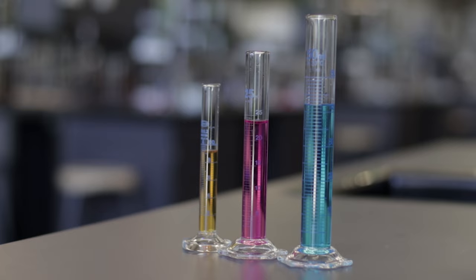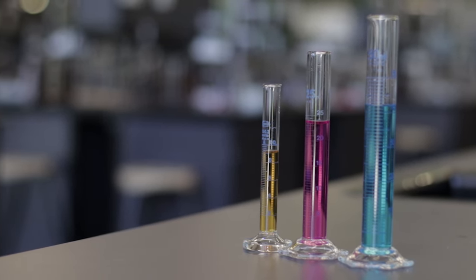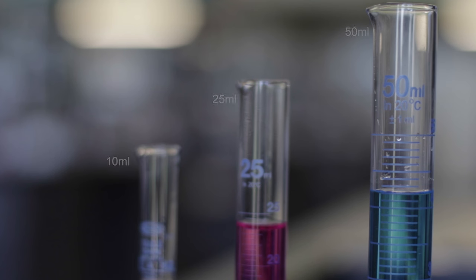A measuring cylinder is used to measure a certain volume of liquid but is not as precise as a pipette or burette. It is found in different volumes. The volume of the measuring cylinder is found here.